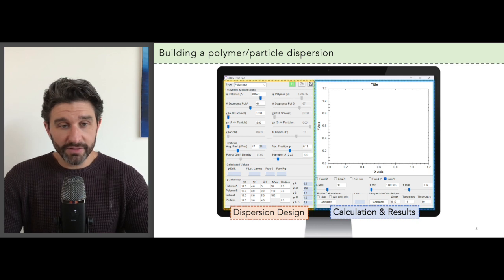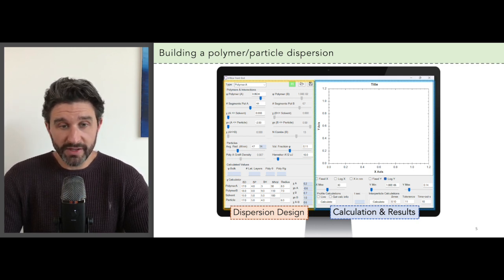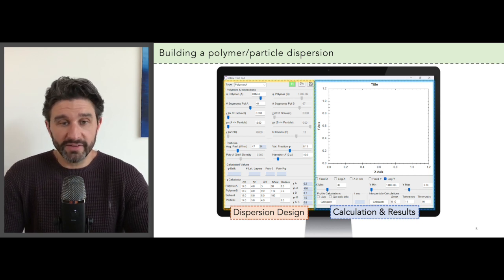On the left hand side you can see all of the input parameters for the dispersion, for example the polymer and the polymer properties as well as the polymer interactions with other entities in the system.